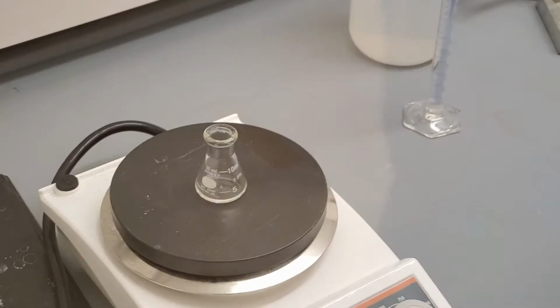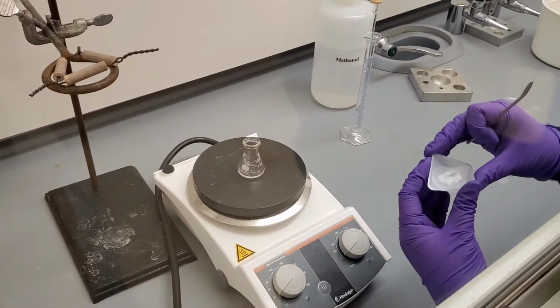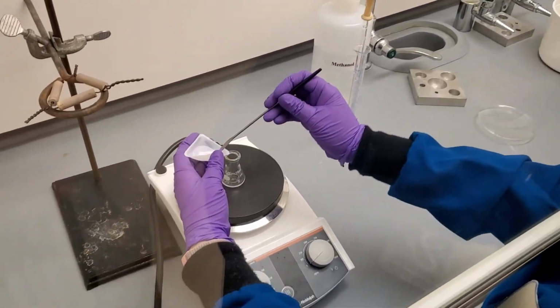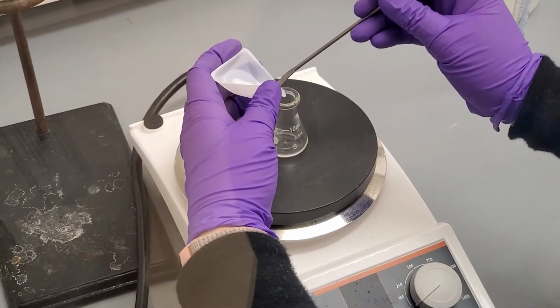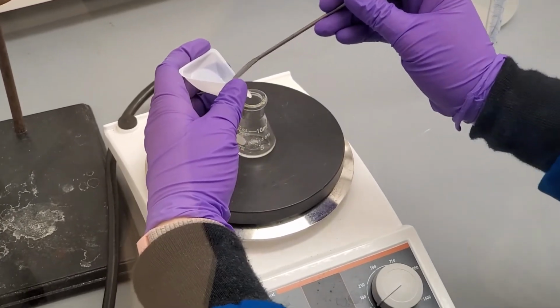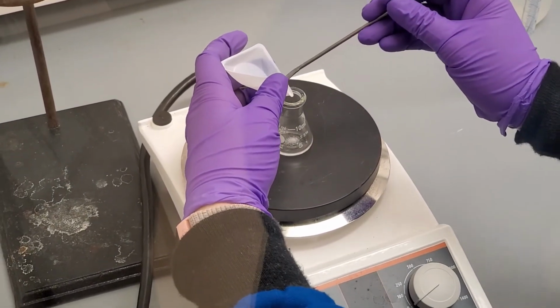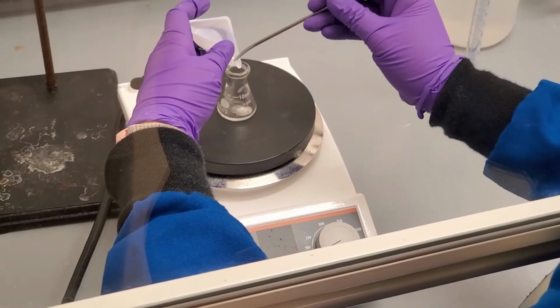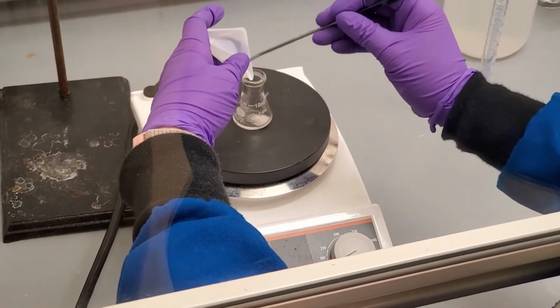Once dissolved, we place the reaction vial on the hot plate. Notice that the hot plate is not turned on yet. We very slowly add the sodium borohydride to the flask. We add it slowly to avoid any violent reactions. If you notice the vial rapidly heating or reacting, cool it briefly in the ice bath.